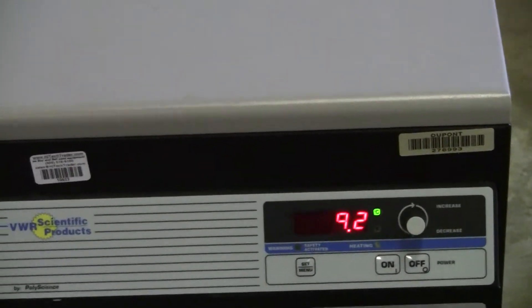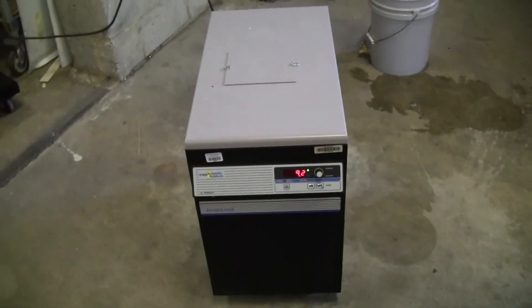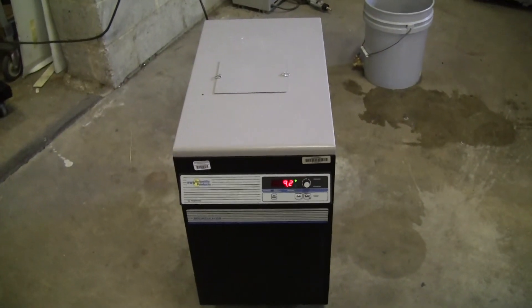And we're down to 9.2 degrees C — you can see the unit is chilling. If you have any further questions, please don't hesitate to call 609-518-9100. Thanks again from Hi-TechTrader.com.